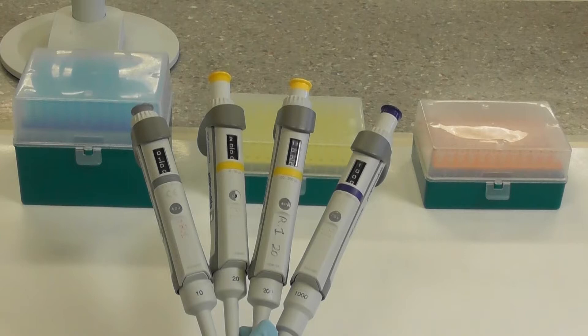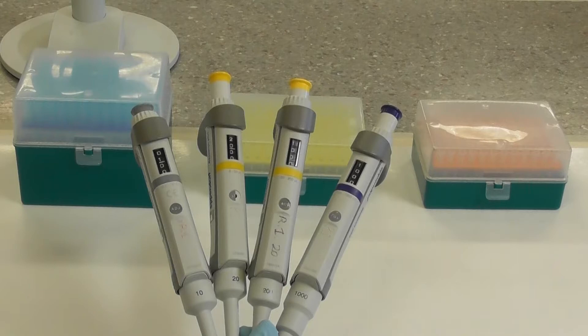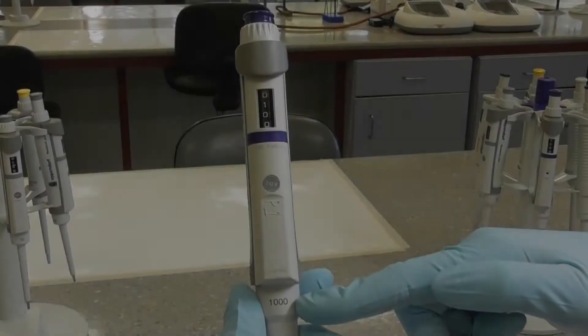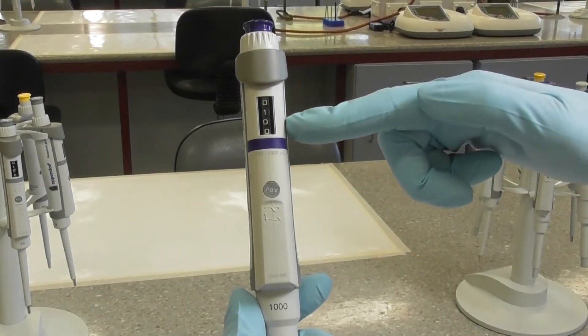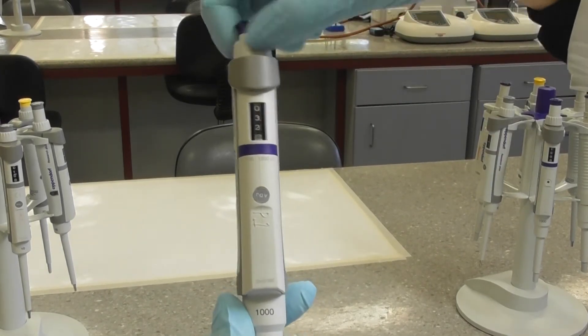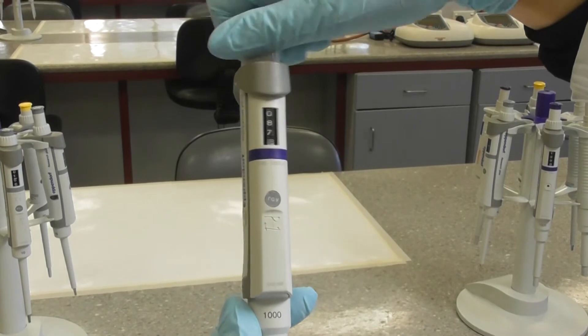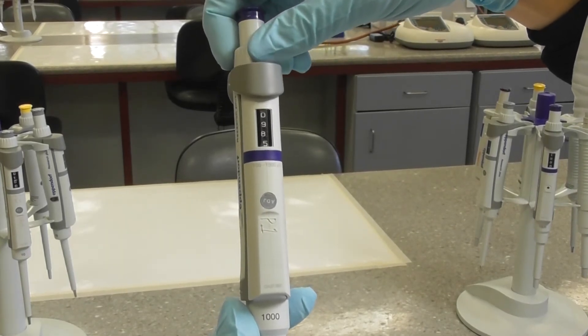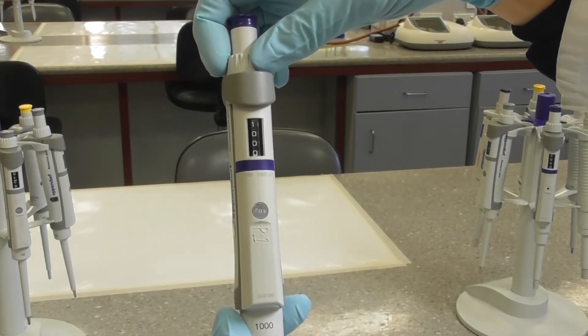The window on the side displays digits to indicate the volume that the pipette will dispense. The 1000 microliter pipette dispenses from 100 microliters up to 1000 microliters. The volume is adjusted by turning the ring at the top.